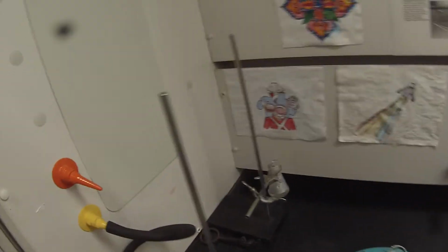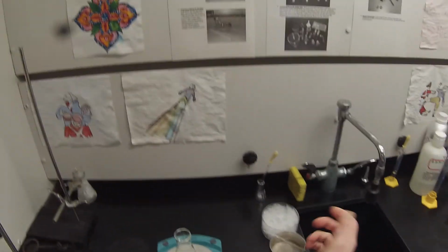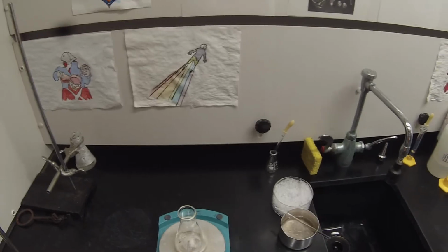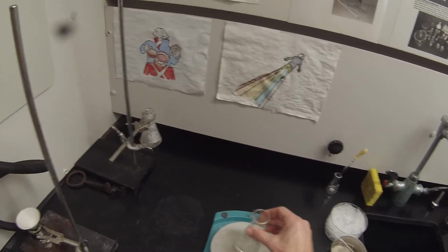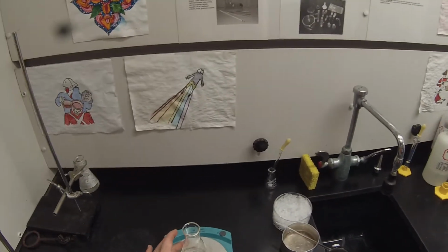So after we filter the acetanilide, once it crystallizes, we're going to dry that in a desiccator so we can get a yield, and then we're going to take 1 gram of that solid and add it to this flask before we add the bleach solution. So that's just going to sit there and stir. Swirl it around, try to get some of those chunks to dissolve. It takes a long time for that to dissolve, so you might as well have that happening while we're waiting for other things to happen.